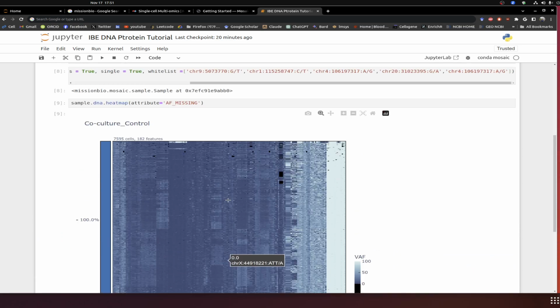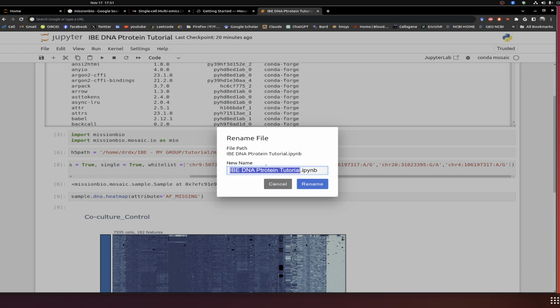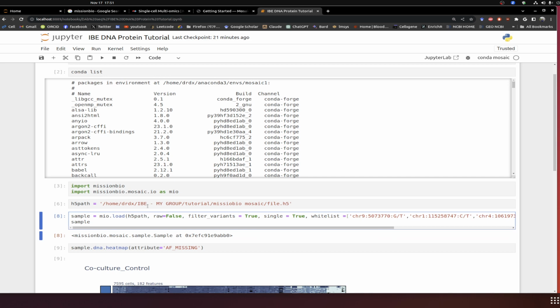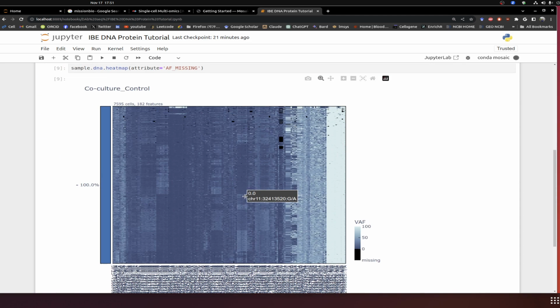That's the way we will analyze the data if you want DNA and protein. I will go through every detail of how to select the CNV, SNV, and everything that you require to be an expert on DNA plus protein data analysis in terms of identifying mutations, making all sorts of graphs that include the protein along with SNV, going through each of the subclones, every single detail you will require. That's the purpose. Okay, thank you.